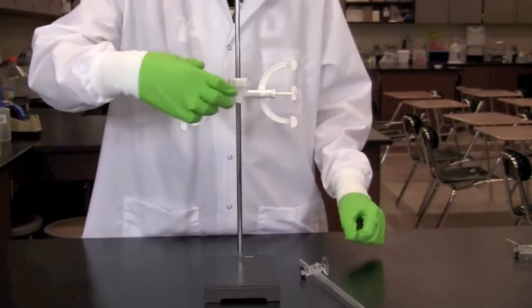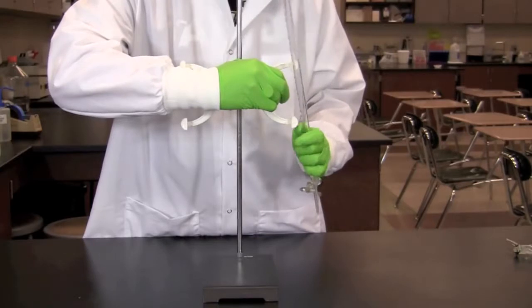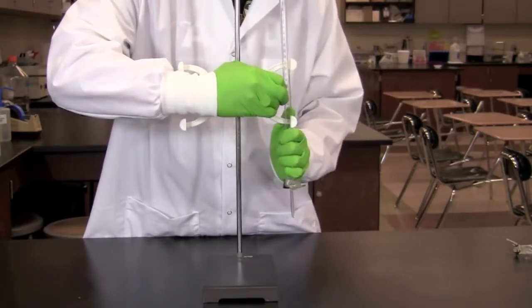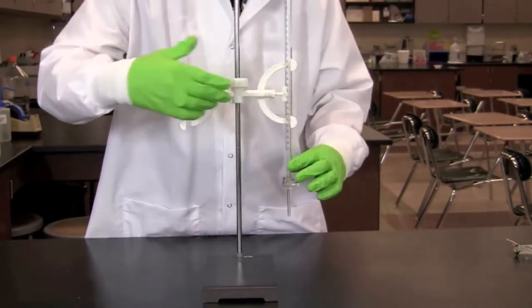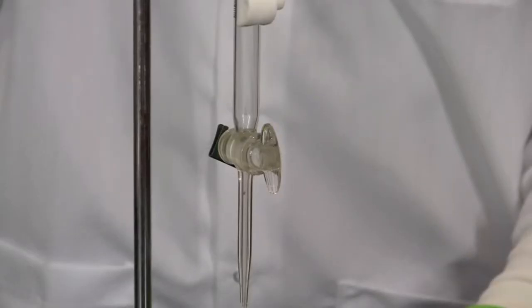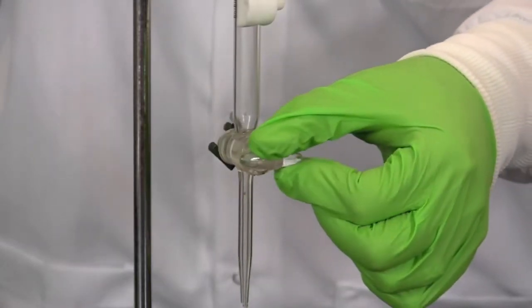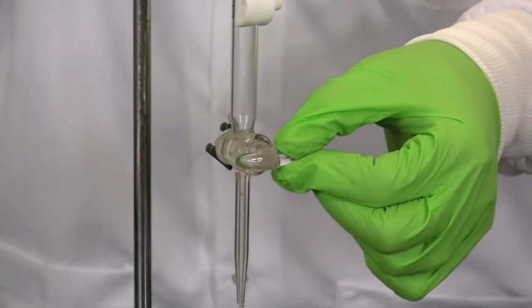First set up the titration apparatus. Clamp the burette into a stand so that it is vertical with the stopcock at the bottom. Make certain the stopcock is in the closed position. It is closed when it is turned perpendicular to the burette.